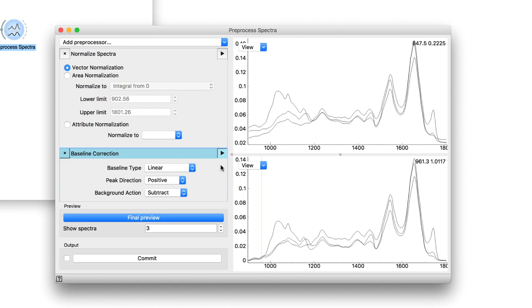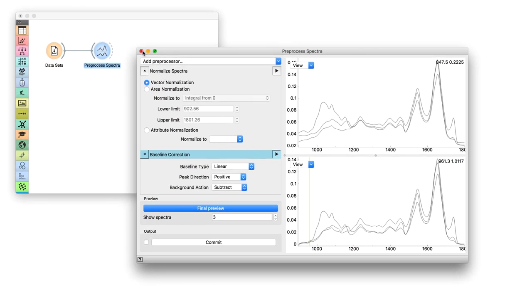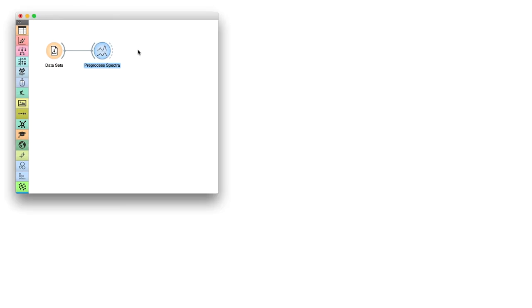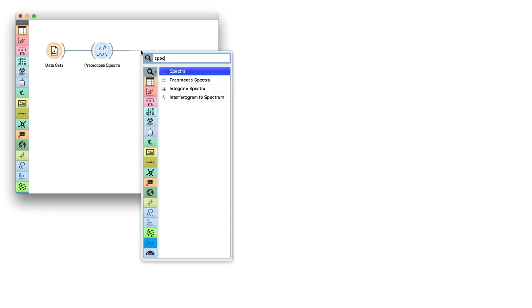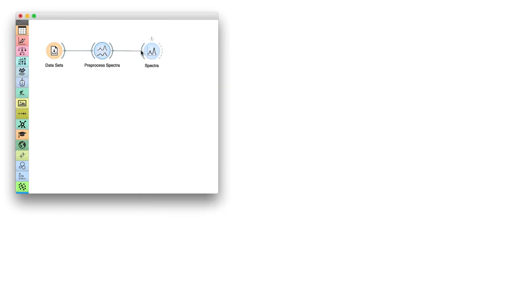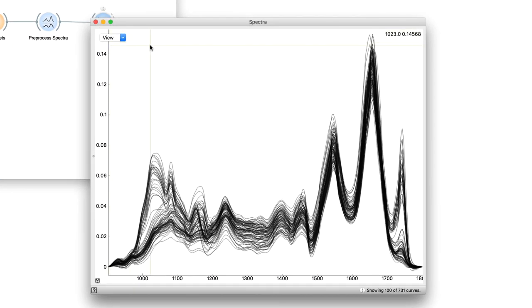Once you are satisfied with preprocessing, click Commit to send the data to the output. We will add the Spectra widget to visualize our spectra. We have two views, individual and average.